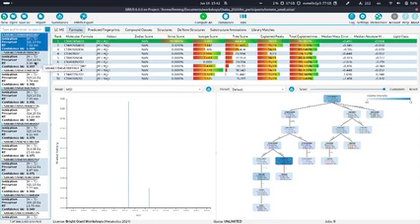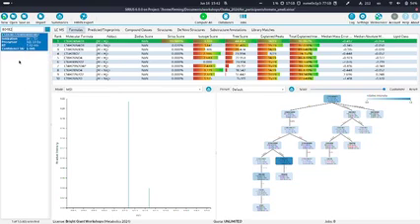If everybody has this feature already, it's nice because you can see exactly what I'm doing. Also, if you don't see this at the top, you can just search for this directly. You can just enter the last numbers of this feature to get it. So this would be 80482. Let's enter this here, and then we will only find this compound in this view here. Okay, and let's go through all the views now, finally.